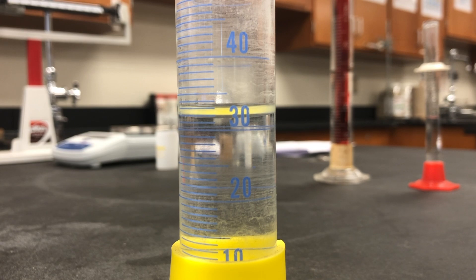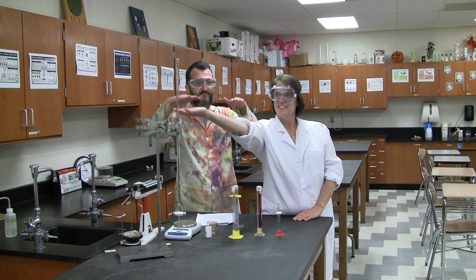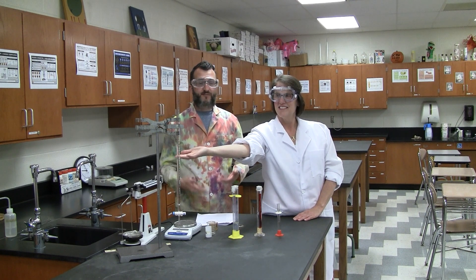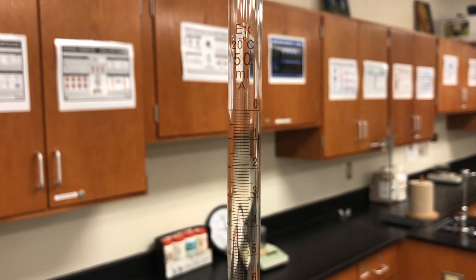Observe the meniscus of the water in the 50 milliliter graduated cylinder at eye level. Record the volume in milliliters in your data tables to the accuracy of the 50 milliliter graduated cylinder — that means estimate an extra digit beyond the smallest increment for proper sig figs.